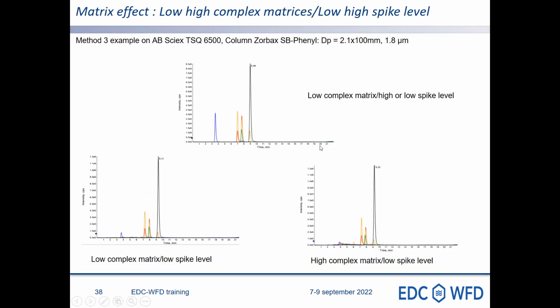And you see that we have very significant matrix effects, especially for estriol, which is the first one to come in the elution gradient. It's difficult to see here with intensity, but we also have a general loss of intensity. So be really cautious with the matrix, it's really a key message. Sample prep is really key for successful quantification.